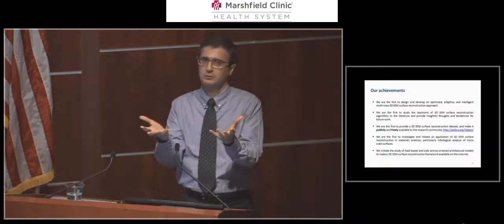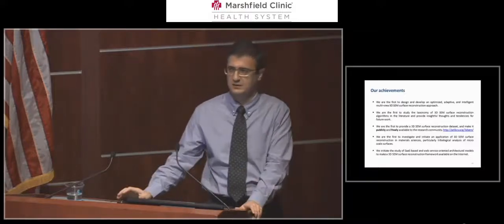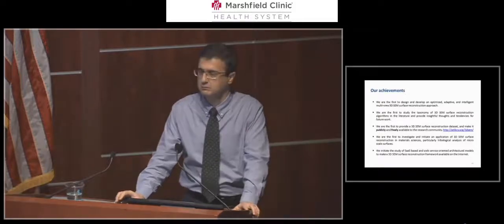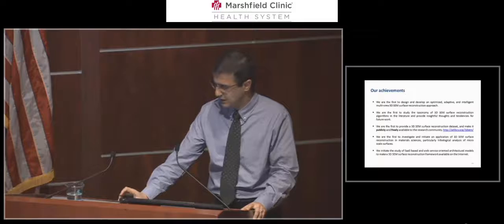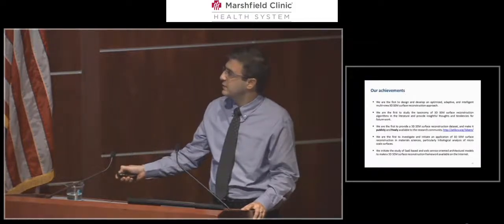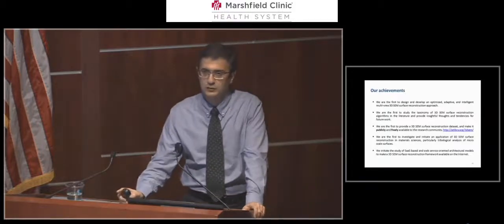We are also able to measure the roughness, waviness, and flatness of the surfaces, which is more appropriate for further studies and interpretation of microscopic objects. We also initiated the study of a SaaS-based, software-as-a-service architecture and web services for 3D SEM surface reconstruction studies.